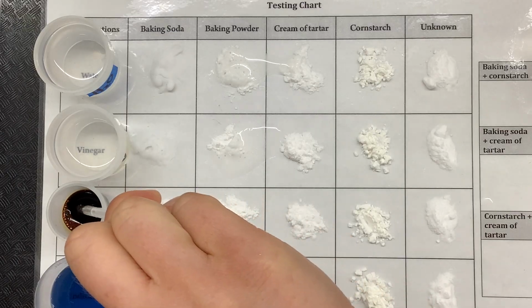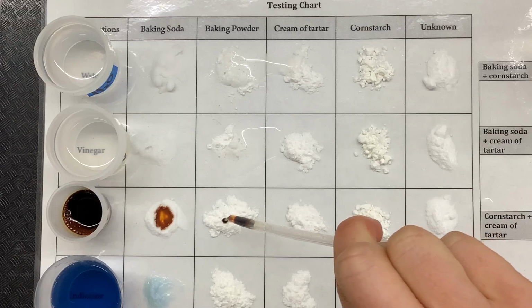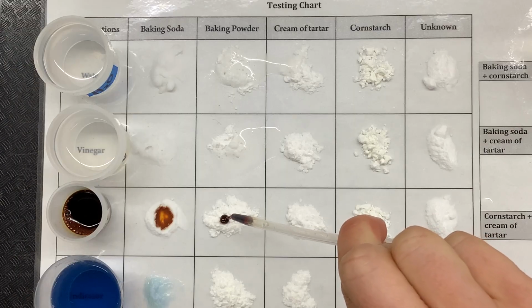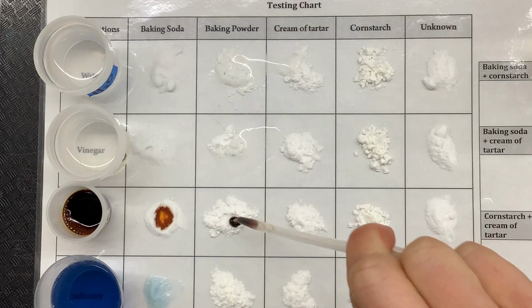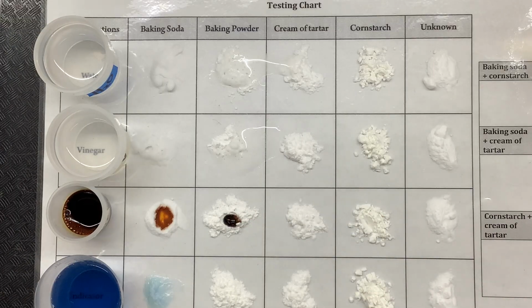Next we've got iodine and baking powder. 3 drops. Maybe a few more than 3. See what happens with the iodine.